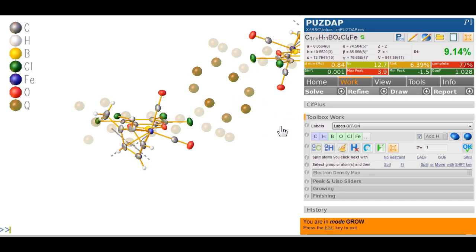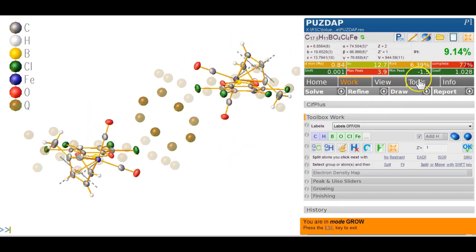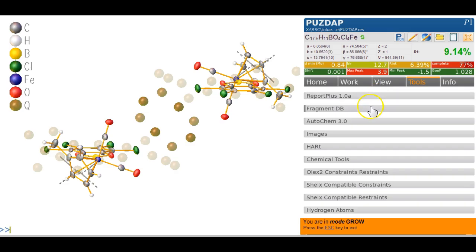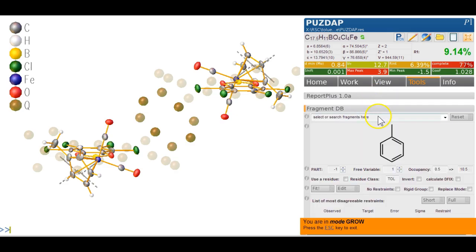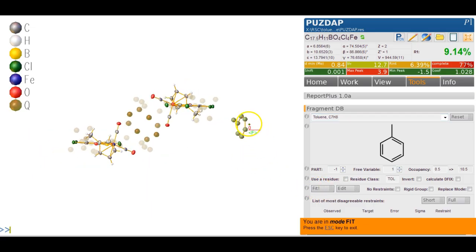How do we model this in Olex2? Well, the idea is to possibly use the fragment db tool and what we do, we type toluene and there it comes and we set it to part minus one because it's across the symmetry element and we set the occupancy to 0.5. Once we've done that, we go fit and that inserts that toluene here.